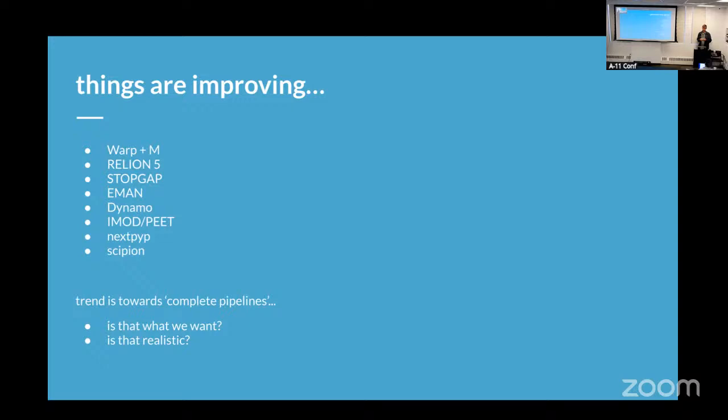And so I don't know that we can ever realistically expect a Relion or a CryoSPARC or a whatever to actually solve all of those problems for you. And so what I advocate for personally is we skill ourselves up a little bit and we empower ourselves to solve the little problems that are specific to our data set. And then we rely on these workflows only for the specific things that they are good at and need. I'd like it if you'd come away with this idea of, oh, I am the scientist, I need to solve my problems. I'm not looking for a piece of software that maybe does everything. These pieces of software do specific workflows really well, but maybe I need to do a little thing myself, and that will be the difference for my project.